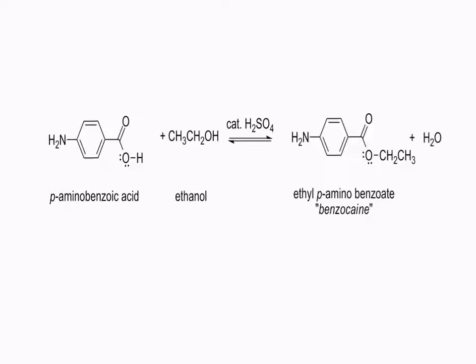This is the para-amino benzoic acid, ethanol, and the catalyst is sulfuric acid, to produce benzocaine.